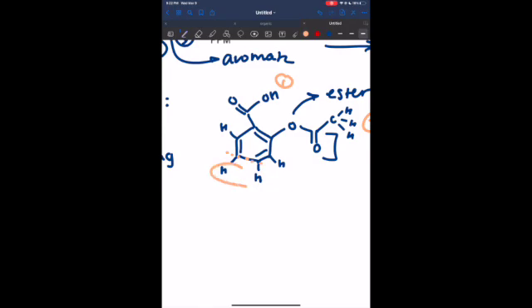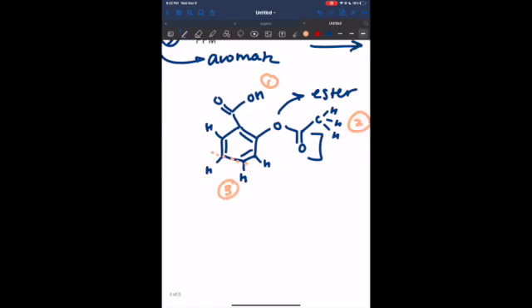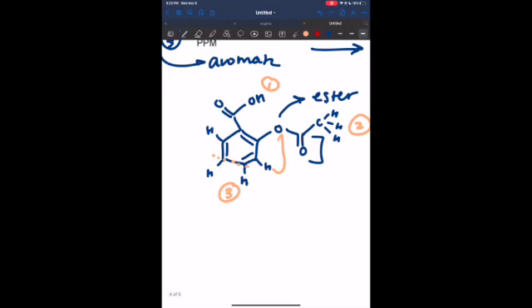So since these hydrogens right here are both adjacent to each other and other hydrogens, I'm going to say that these two share a signal. So I'm going to give this one its own, because this hydrogen is adjacent to an oxygen, and this one's adjacent to a hydrogen.